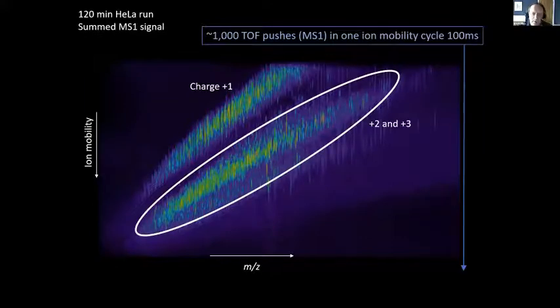Sure. So we started with OpenSwath because this was a great place to prototype things and get the method working. And this is still the tool that I'm using. In terms of analyzing the DIA PASEF data, Skyline is now pretty much fully compatible, I think. Spectronaut is also fully compatible, and I think people are starting to see nice data from using Spectronaut. You mentioned MaxQuant. MaxQuant is compatible with the DDA PASEF data, but it's my understanding that they will have a DIA implementation. I'm not sure what the status of that is at the moment. And there are also some commercial tools, so Peaks, for example, I think can handle the DIA data. And DIA-NN, this neural net-based one, has an alpha implementation, I believe.